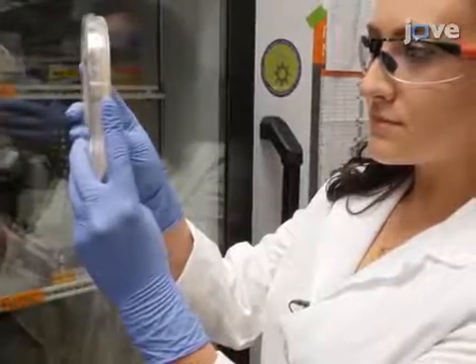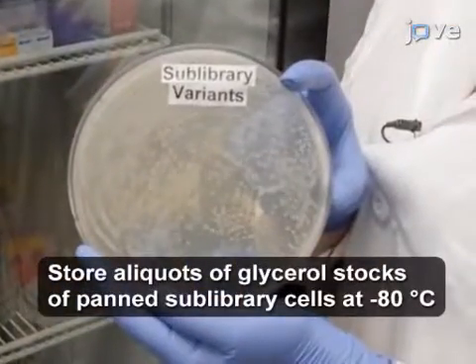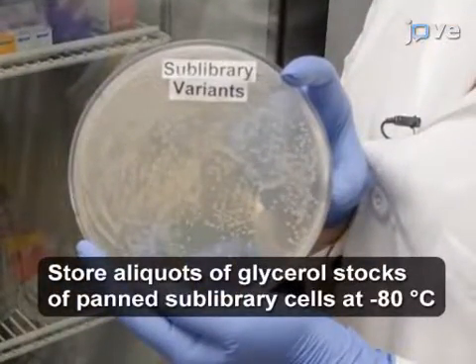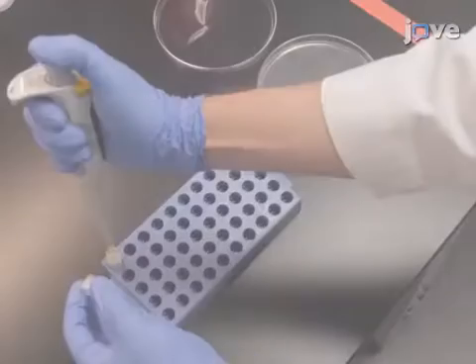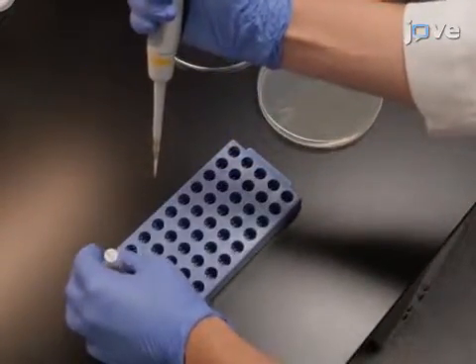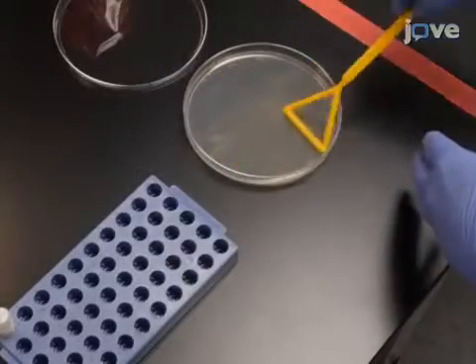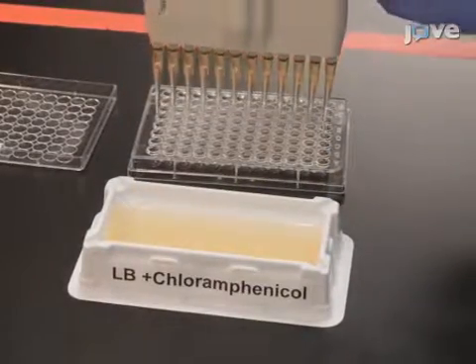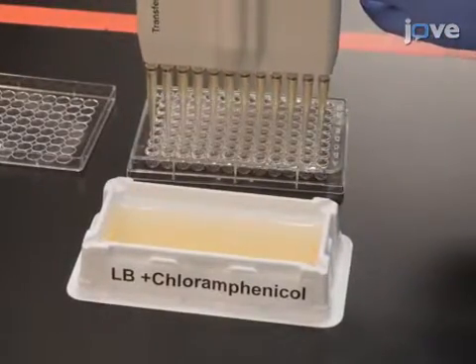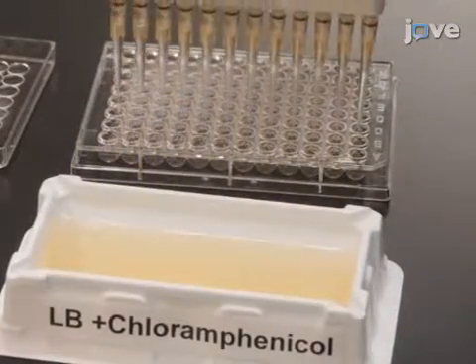Transform the entire reaction into MC4100 E. coli cells according to the text protocol. To identify clones using ELISA, thaw one tube of the panned sub-library and plate on LB agar plates. Add 200 microliters of LB with 20 micrograms per milliliter of chloramphenicol into each well of a round-bottom 96-well culture plate.